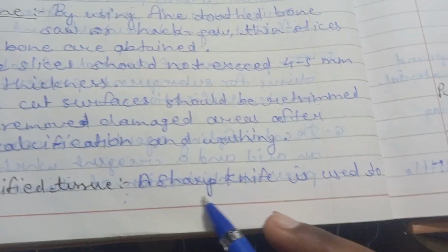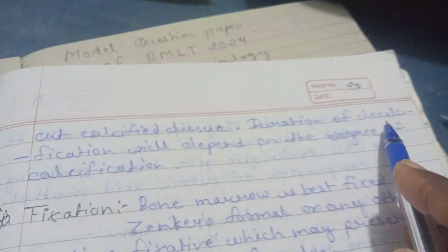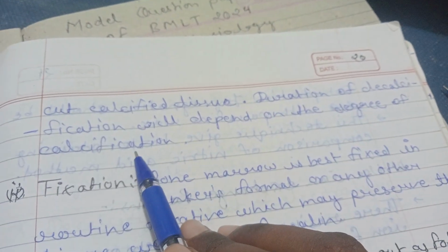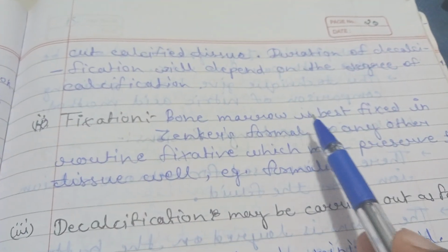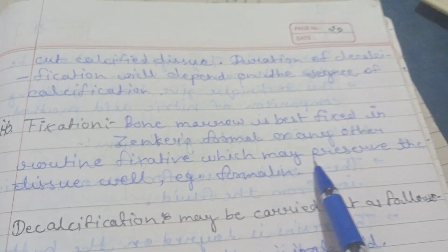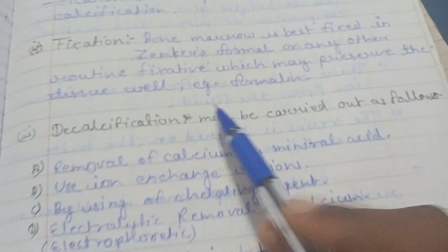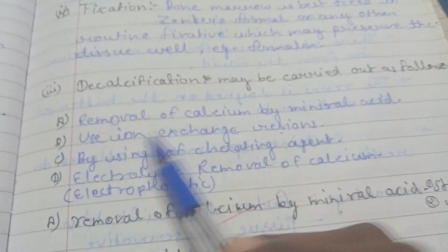Calcified tissue: a sharp knife is used to cut calcified tissue. Duration of decalcification will depend on the degree of calcification. Fixation. Bone marrow is best fixed in Zenker formal or any other routine fixative which may preserve the tissue well. Example, formalin. Next, decalcification may be carried out as follows.